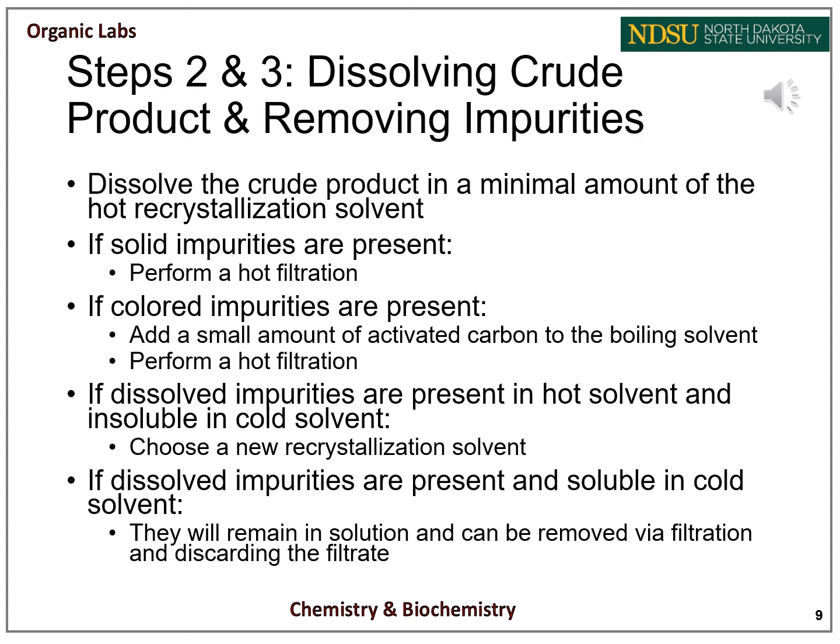If dissolved impurities are present in the hot solvent and soluble in the cold solvent, they will remain in solution and can be removed via filtration and discarding the filtrate.